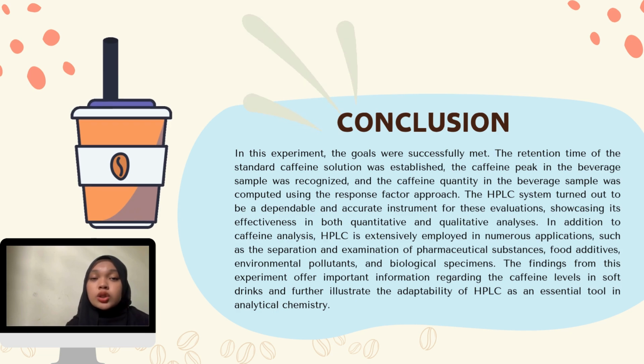In addition to caffeine analysis, HPLC is extensively employed in numerous applications such as the separation and examination of pharmaceutical substances, food additives, environmental pollutants, and biological specimens. The findings from this experiment offer important information regarding the caffeine level in soft drinks and further illustrate the adaptability of HPLC as an essential tool in analytical chemistry.